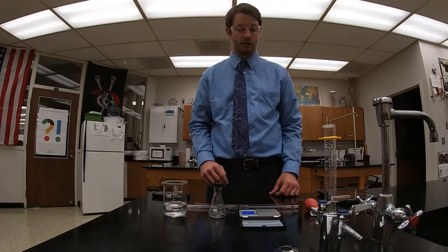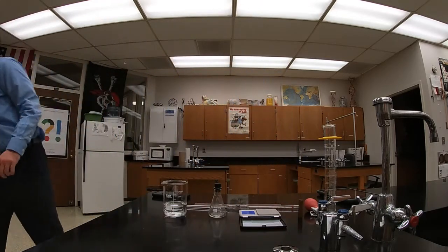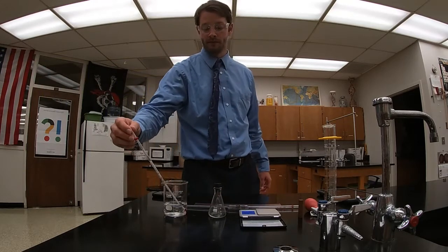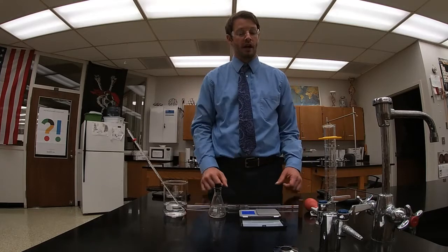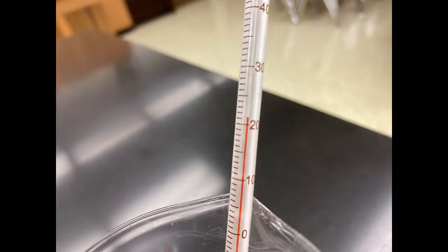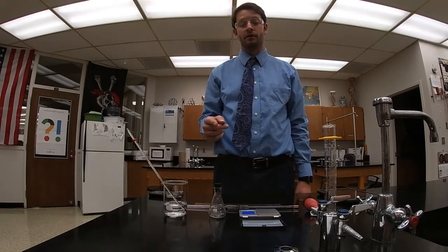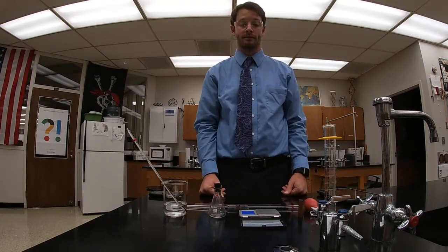For the second part, you want to use a thermometer to take the temperature of your distilled water. To do this, you place the thermometer in the water and you let it acclimate. Since the water has already been acclimated to room temperature, the thermometer should not see much movement. You'll need to read the thermometer to the tenths. Once you have the temperature from the thermometer, you can reference the table to determine the density. You record both of those on the line.